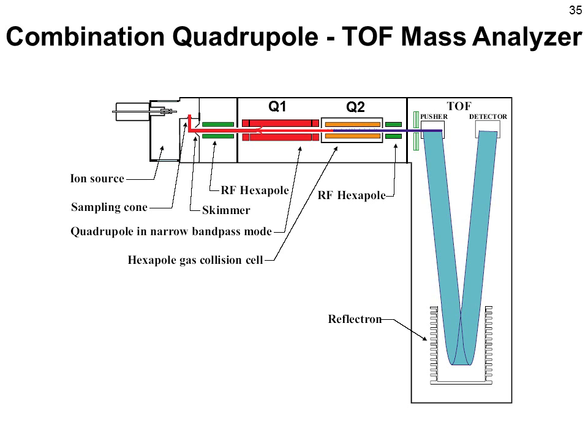What is the advantage of such a combination? The main advantage is that you can do a standard quadrupole type of experiment in the beginning, selecting ions, fragmenting them, but then getting very high resolution and accurate mass measurements of the fragments. This helps especially in complex samples like proteomics or metabolomics samples, where you have many compounds and you would like to, A, measure them accurately without interference by other ions, and second, sometimes you would like to identify them, so you need high mass accuracy for the identification.